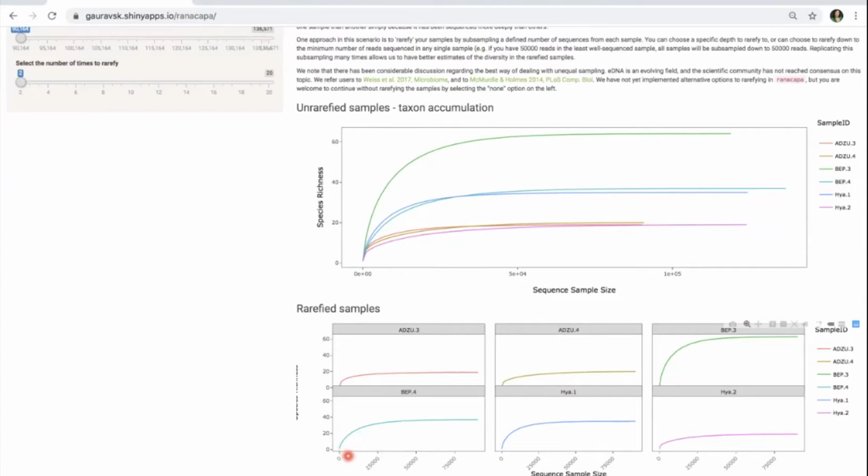But eventually, we get to this point, and at this point, it's at about maybe 20,000. Let's be generous and say 25,000. At about 25,000, what the software has counted as unique bacteria is about, let's say, 30. And so what that means is that even though it's randomly subsampled 25,000 sequences, it's only found 30 unique bacteria in those 25,000.